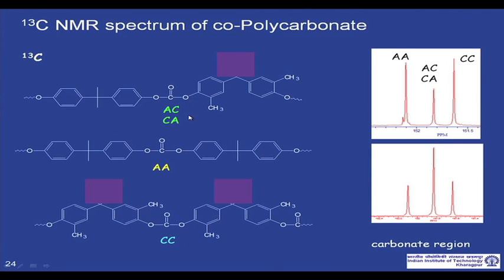So, this is an example of a co-polycarbonate which consists of BPA and this other compound, TMBPA type, we are talking about.